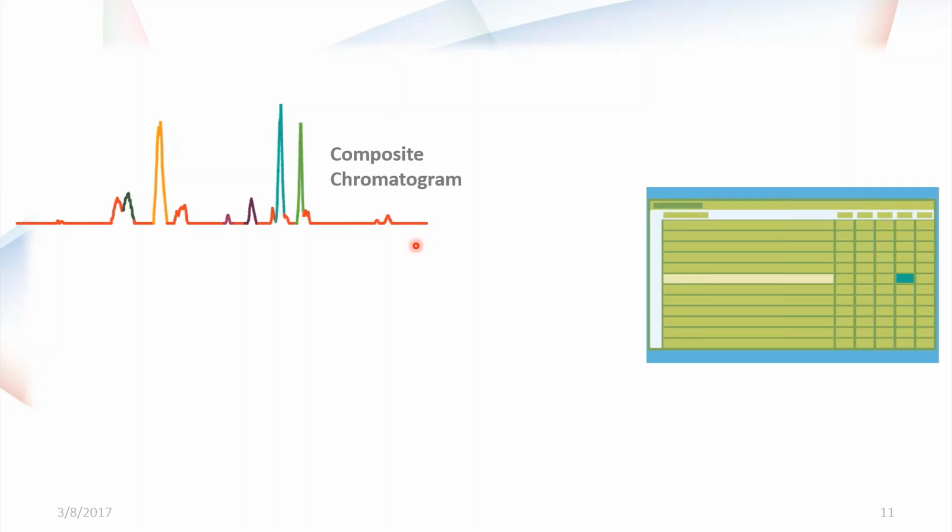What you're seeing is a composite chromatogram. And what that means is that this is essentially a synthesized chromatogram, and it's under one set of conditions showing peaks from both MS and UV detectors as well as components from different subsamples. For example, this chromatogram contains peaks that were observed for the API, acidic degradation, which is the red colored chromatogram, as well as process impurities, which are shown in orange.